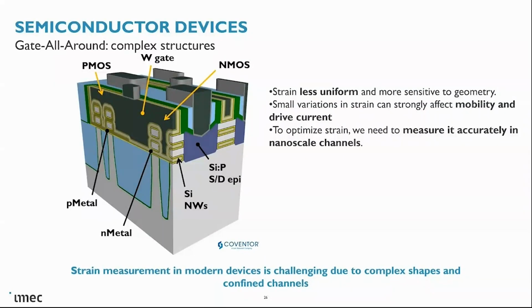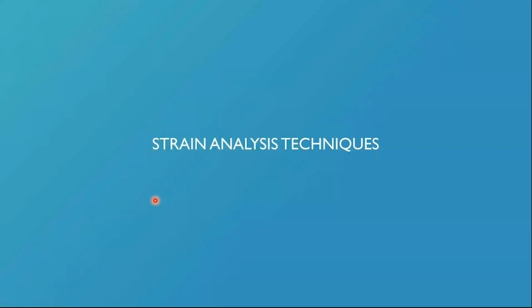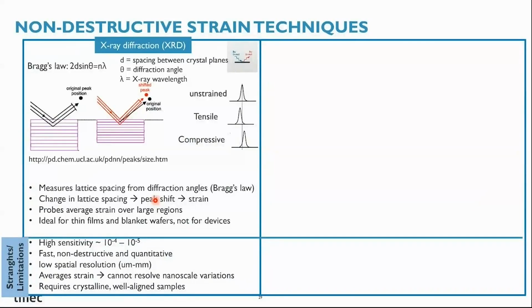At this point, I would like to pass to the second part of the presentation, where I will discuss a few strain techniques. I will focus on TEM techniques, but I have just one slide showing different techniques because I think those are important, since those are non-destructive techniques. As you know, TEM is a destructive technique. So I think it's worth mentioning them.